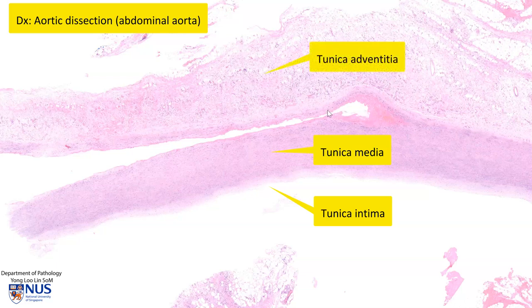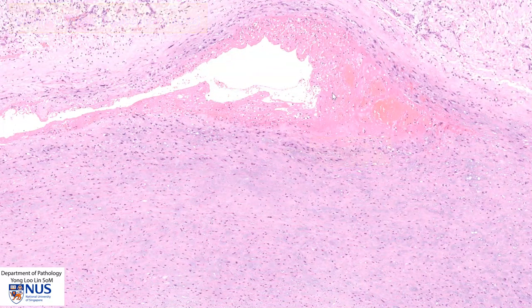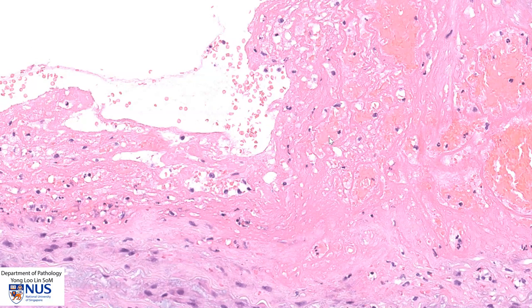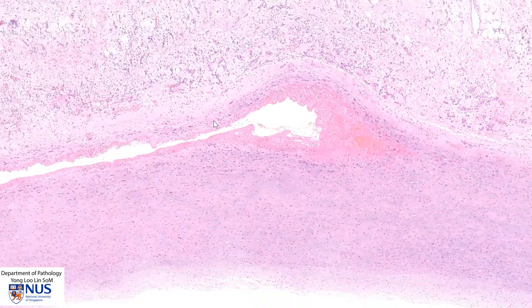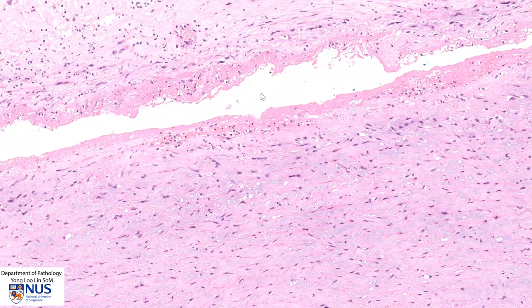The pathology is in the layer of the tunica media, and the diagnosis here is aortic dissection. What we can see is actually part of a hematoma — blood with a lot of fibrin — which is recognized as these strands of pink material with some entrapped leukocytes. This is present in the deep layers of the tunica media, and we can see tunica media on both sides with smooth muscle bundles here as well as smooth muscle bundles here. There is a little bit of pink fibrin here as well within the space.